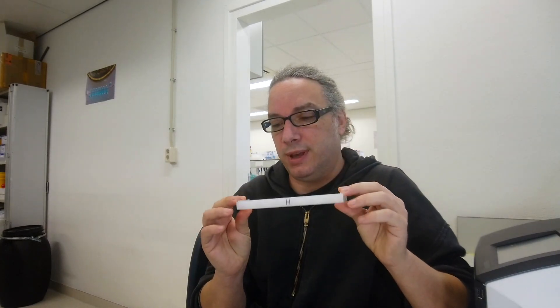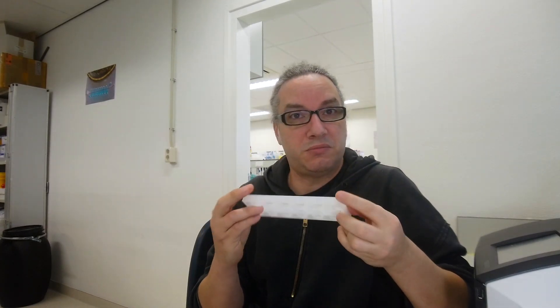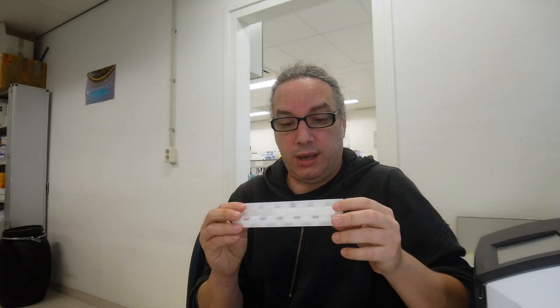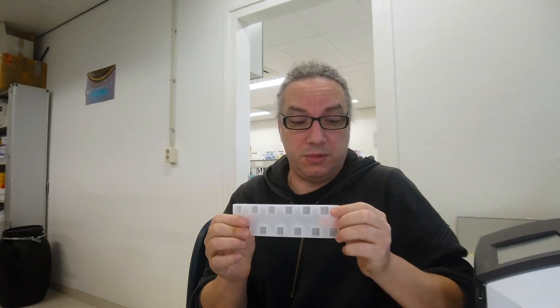How much do you think this should cost? If you say a few euros, you will be factually correct. This is just a piece of plastic, it's injection molded and cheap to produce, and the material is probably polypropylene, so not even that expensive.